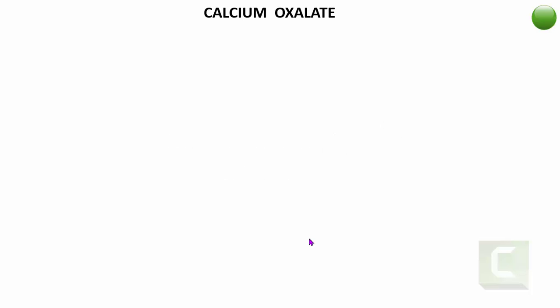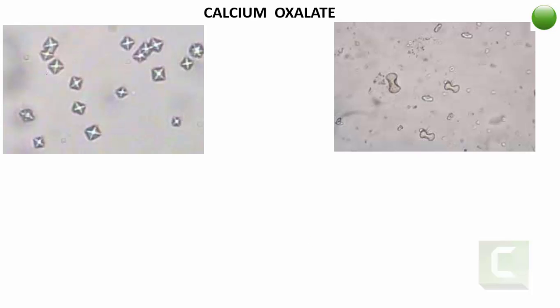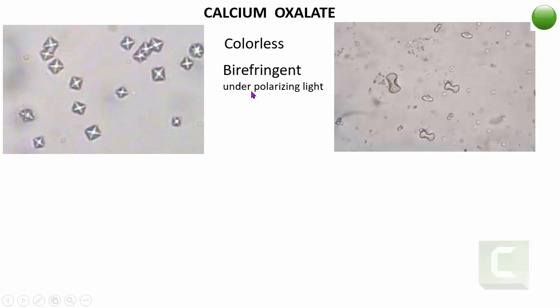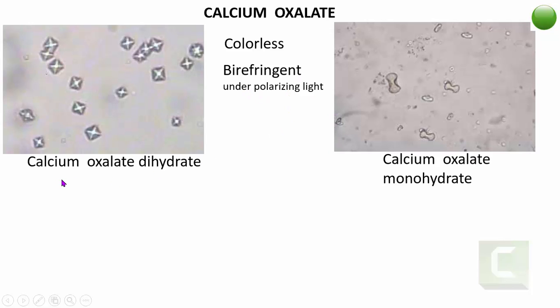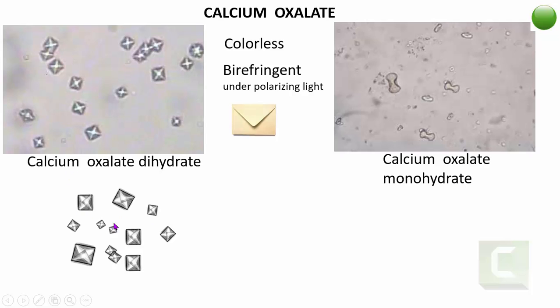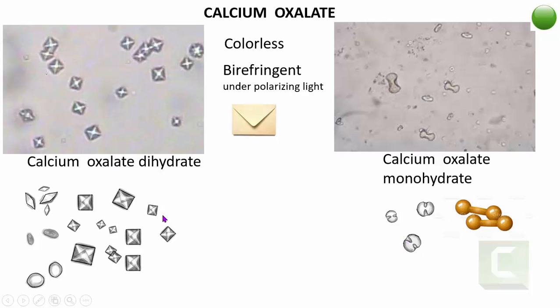The first and most important crystals found in urine are calcium oxalate crystals. These are colorless crystals, and they are birefringent when observed under polarizing light. There are two forms: calcium oxalate dihydrate and calcium oxalate monohydrate. The dihydrate form is the classical envelope-shaped crystal. The monohydrate form is hourglass-like or dumbbell-shaped. Other morphological forms include elongated, oval, and round or spherical shapes.